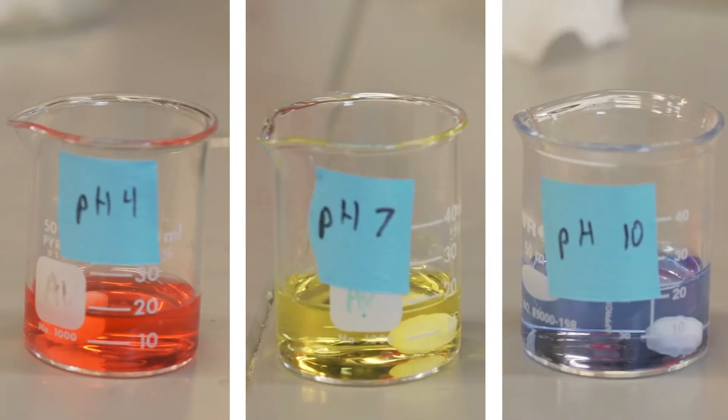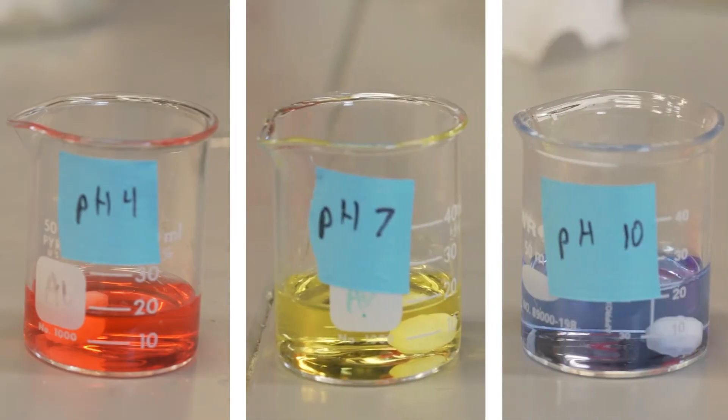Before we can use the pH meter to take a measurement, we first need to calibrate it using a series of standard buffers with known pHs of 4, 7, and 10.